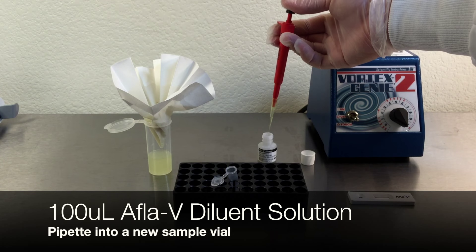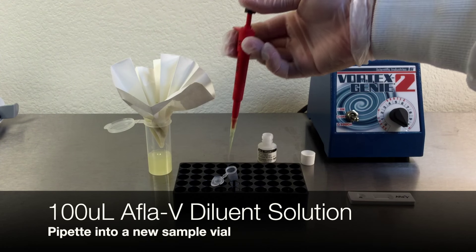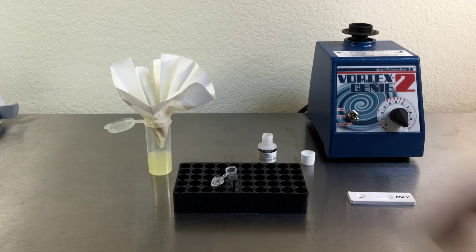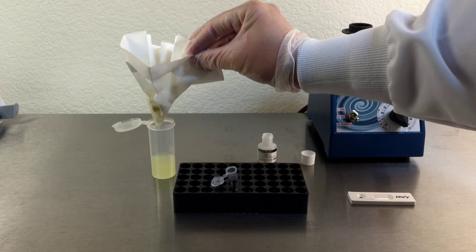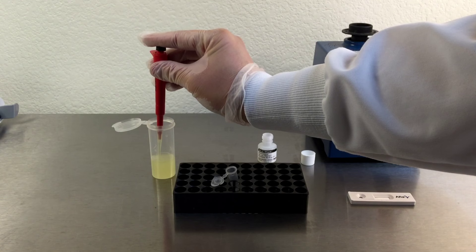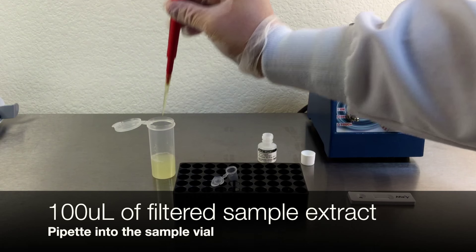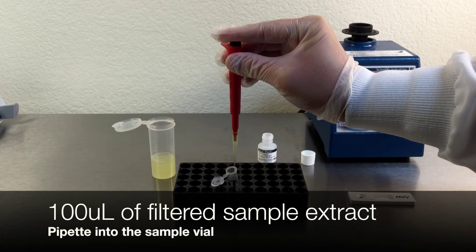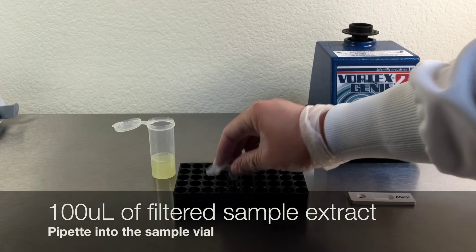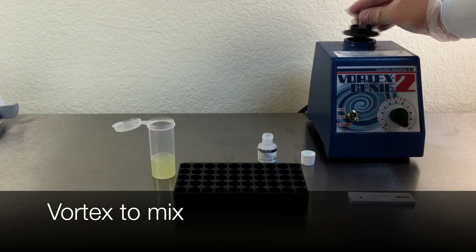Pipette 100 microliters of Afla-V diluent solution into a new sample vial. Pipette 100 microliters of filtered sample extract into the sample vial. Seal the sample vial and vortex to mix.